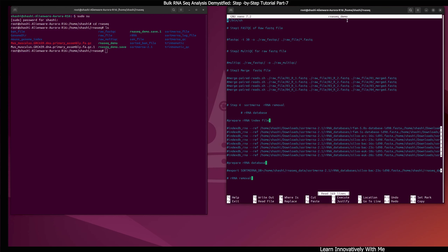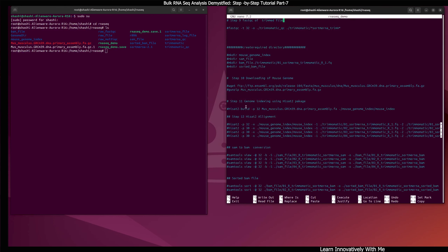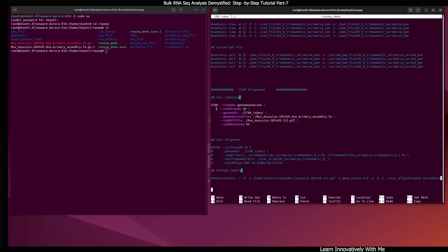Here in the script file — rnaseq demo — I have already written the STAR indexing command. For the indexing we need a genome file. I'm using the mouse genome, but in your case you can download the primary genome according to your organism. We also need the GTF file. Let me first show you how to download the genome file and GTF file from the Ensembl database.